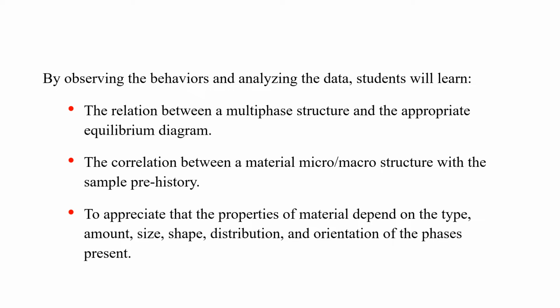By observing and analyzing, students will learn the relation between a multiphase structure and the appropriate equilibrium diagram, and the correlation between a material's macrostructure and the sample prehistory. Appreciate that the properties of a material depend on the type, amount, size, shape, distribution, and orientation of the phases present.